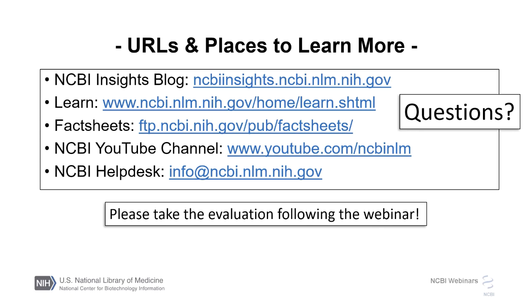What's the level of curation? Is it possible to maybe expand these databases, but then fragment them by those that have really good curation versus those that may be part of uncultured taxa or metagenomic profiling? What goes into these targeted loci databases?